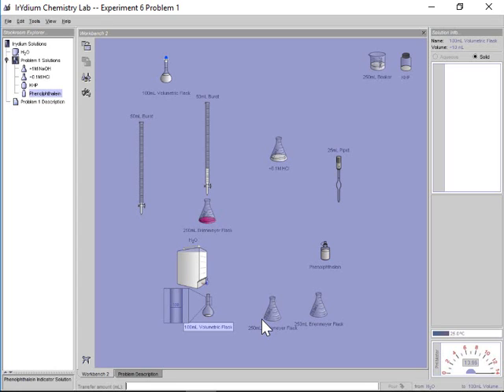8 mils. I'm going to toss in, let's say, 88 milliliters safely, right? That's going to pretty much fill up my volumetric flask. 88 plus 8 is 96. And then again, just demonstrating that proper dilution technique here, I'm going to slowly drop it in sort of 1 mil at a time. As I get really, really close up to the top, maybe drop it in at 0.5 mils at a time, 0.5 mils, 0.5 mils. I'm getting really close, maybe 0.05. Just do this with a dropper. I want to be really, really precise here so that this is exactly going to be 100.